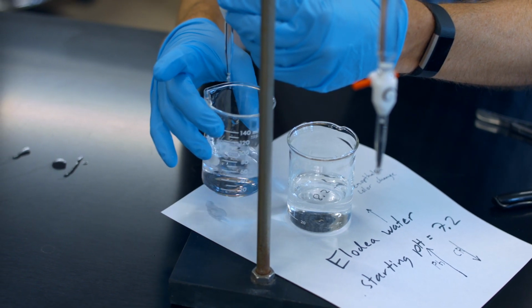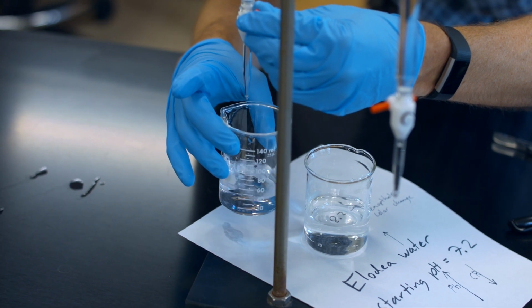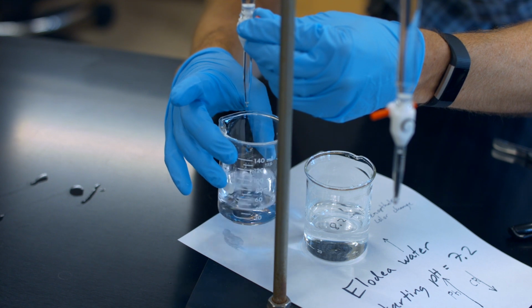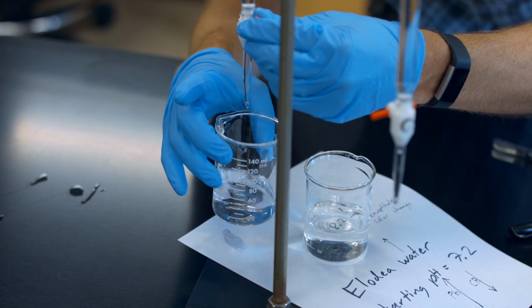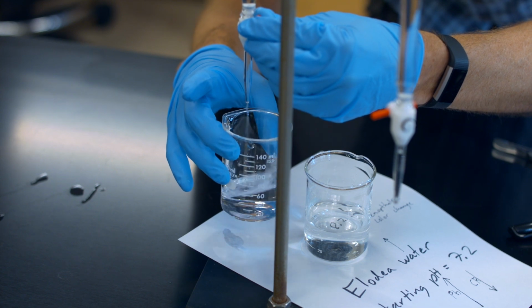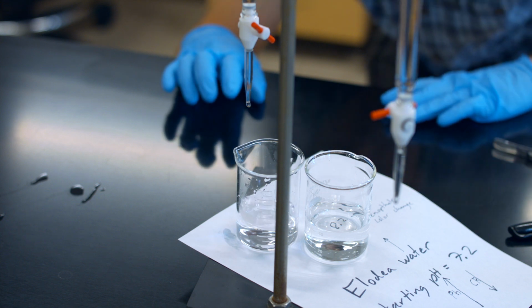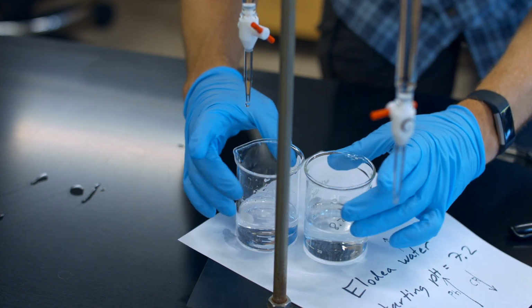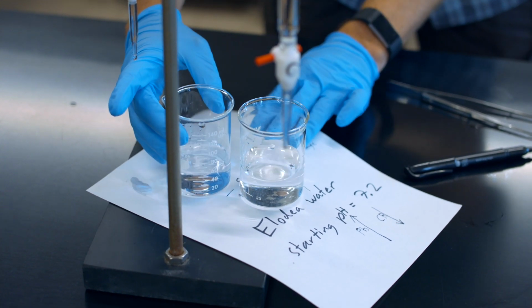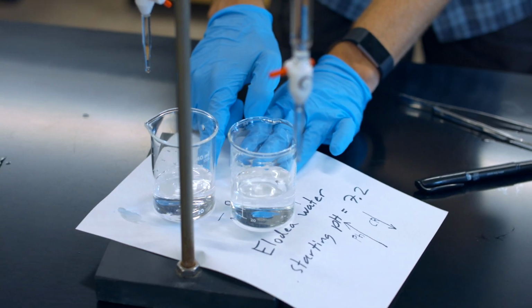This one you really want to slow down because when it goes from clear to pink, there is no gradual change. It's just going to start to turn pink, and that pink is very subtle. Whereas going the other direction, you could see it was getting less pink, and then you could find that spot right when it turns clear. Here, we want to be really careful, and you can start to see, I don't know if you can zoom in there a little bit, but you can see that there's a different color in that right there. It's starting to be a little bit pink.